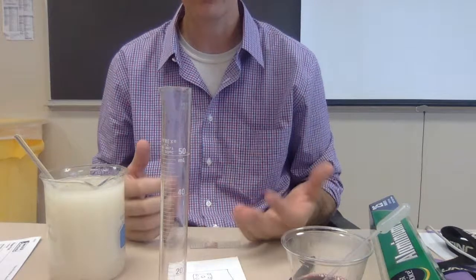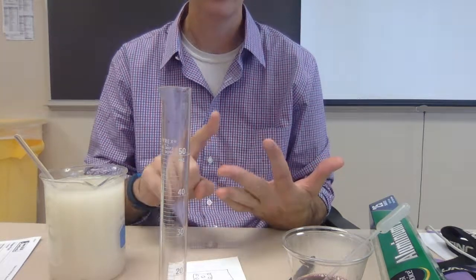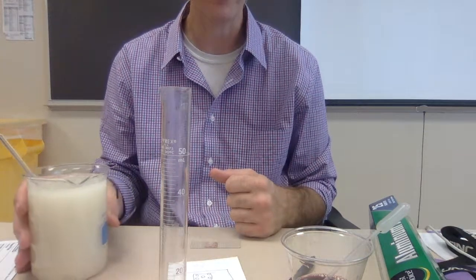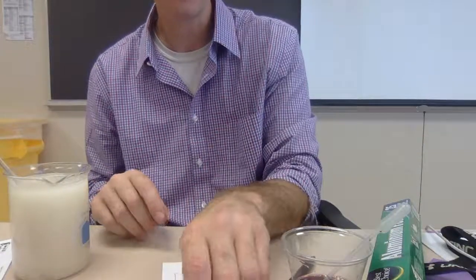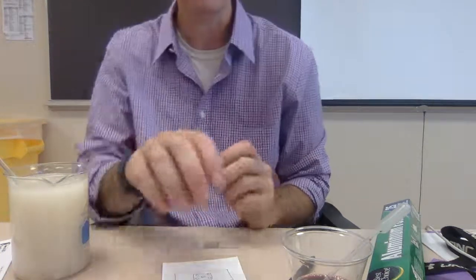And then when you're totally done, clean up your lab station, rinse out your beakers and your graduated cylinders, put the slides on a clean paper towel, and that should be it for the lab. All right, after the lab, you're going to watch a video presentation of section 4.1, and I will send you the link to that video as well.